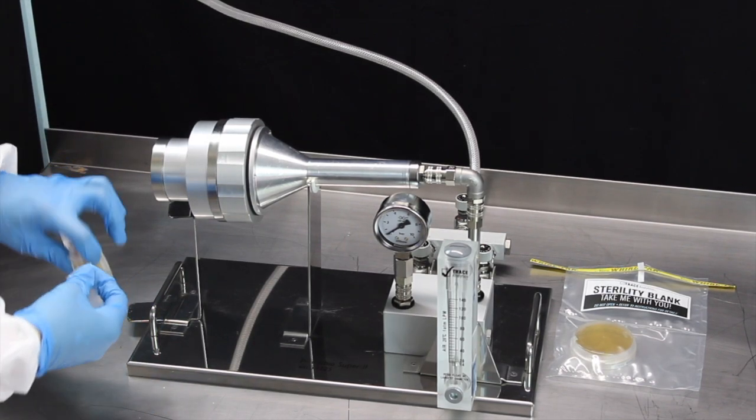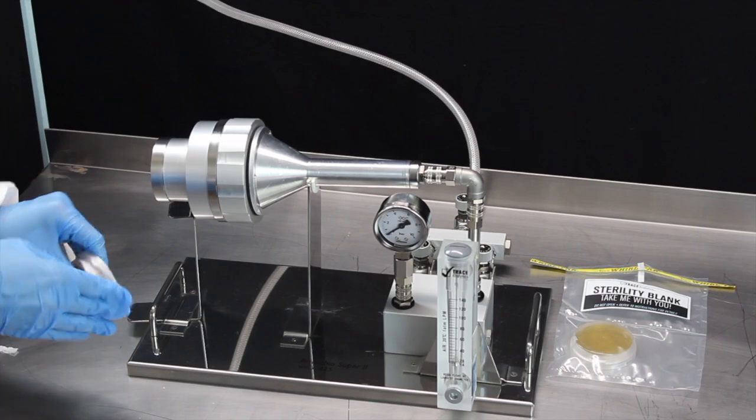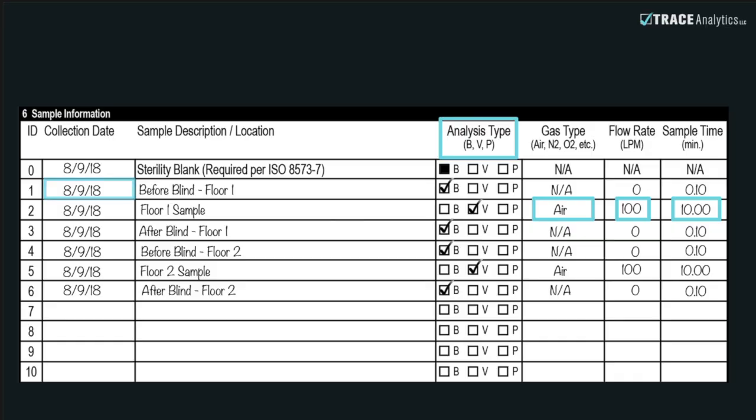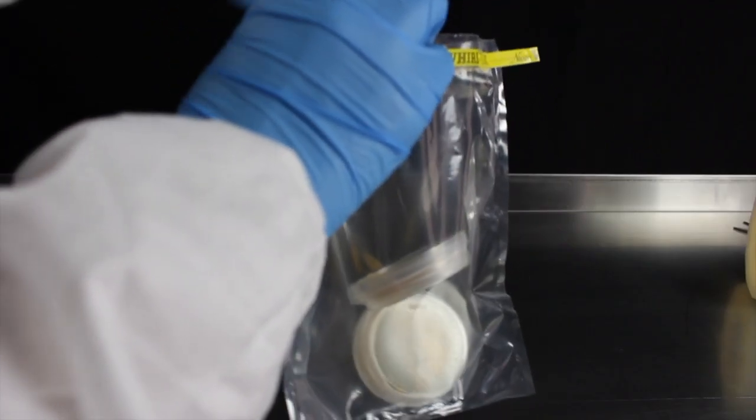Parafilm your contact plate. Label the base of your plate with a permanent marker using the appropriate number from your chain of custody. Fill out your chain of custody, making sure you write down the flow rate and sample time since this is an air sample, not a blind. Place the sealed and labeled plate in the provided sterile bag.